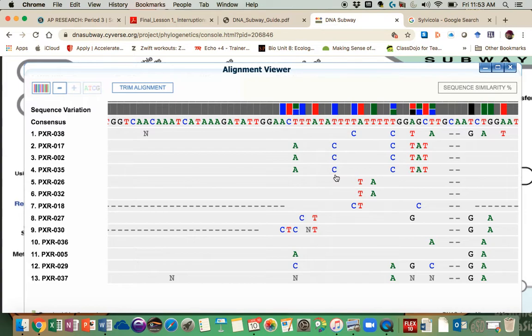And so we call these variants. It doesn't necessarily mean that there's a mutation. It doesn't mean that it's a different species other than what it's identified with. But that's some of the information that we use in your findings to go back and say, okay, here's what's going on in this environment, and we can see some of the variants here. Okay? So that's what that means.